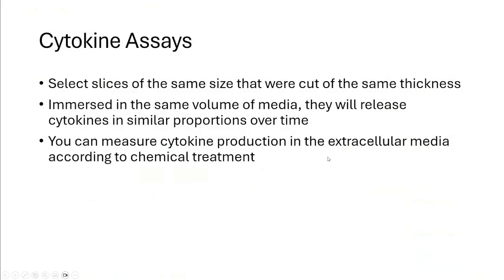You'll have to make sure your slices are roughly about the same size. So just as long as you check your slices and make sure they are roughly about the same size, you shouldn't have too much variation in your experimental groups.